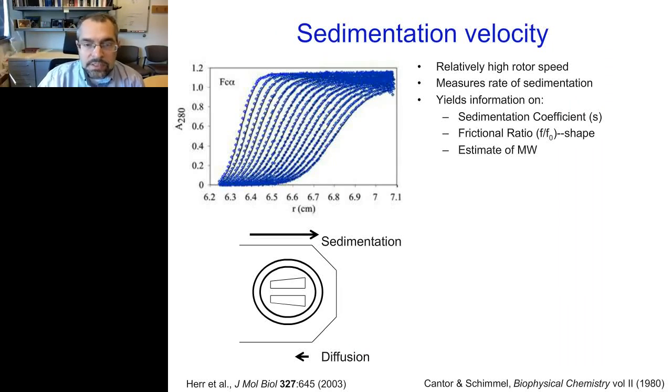All right, so this is an overview of the sedimentation velocity type of experiment. What you're looking at is a series of sequential scans of the protein taken every 2 or 3 minutes, and you can watch how the protein is actually moving through solution in real time by these different snapshots. And so, for example, this is the first snapshot, and you can see this is the location of the protein at that point in time, and then several scans later it has moved further down, and eventually it will clear all the way through the cell.